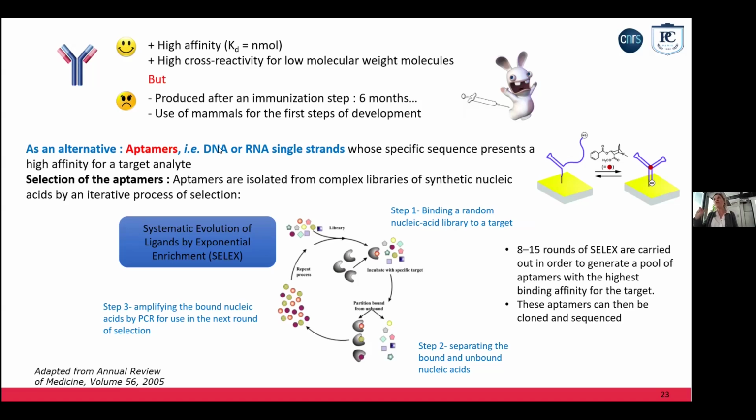If you manage the pH of your samples, okay. You just have to control, because sometimes, as an example, for ochratoxin A, we developed this type of approach. If you don't give calcium to your DNA sequence, it doesn't work, because the sequence has a specific conformation. This is what we call G-quadruplex. And to form G-quadruplex, you need calcium and magnesium. So we just add calcium to the sample before the incubation and it works, whatever it is: soil extract, river sand, regular water, plasma sample.